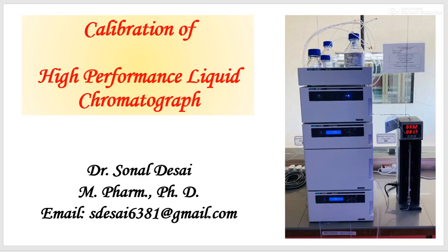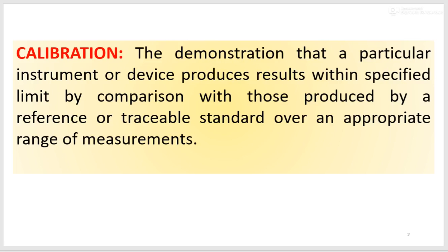Today, we will discuss calibration of high performance liquid chromatograph. What is calibration? It is demonstration that a particular instrument or device produces results within specified limit by comparison with those produced by reference or traceable standard over an appropriate range of measurements. In other terms, calibration means comparison of unknown with reference or traceable standard.